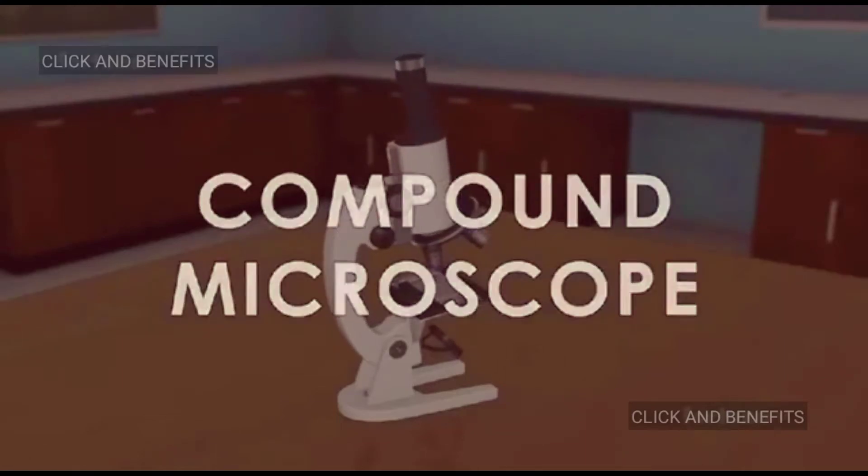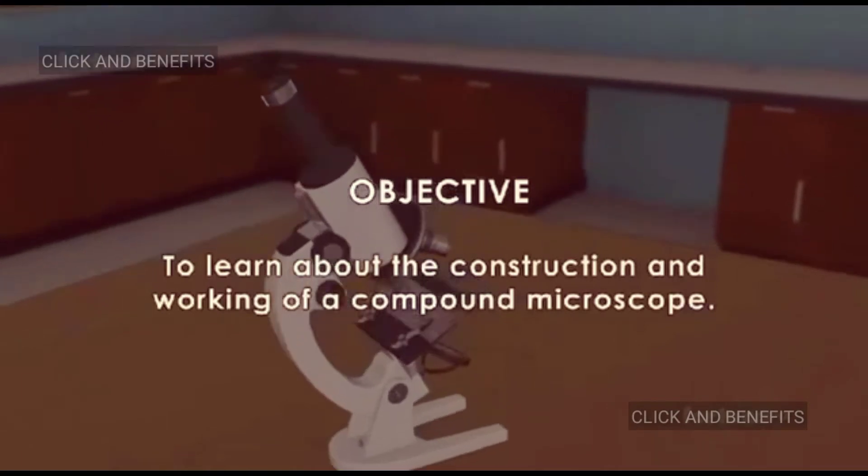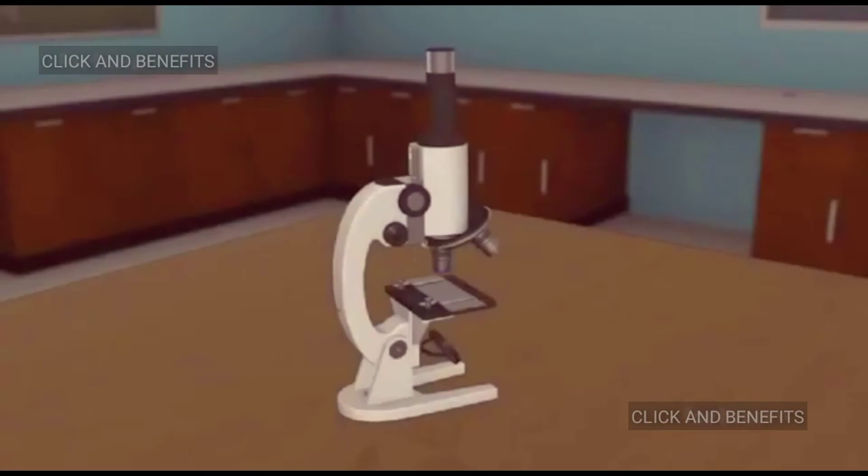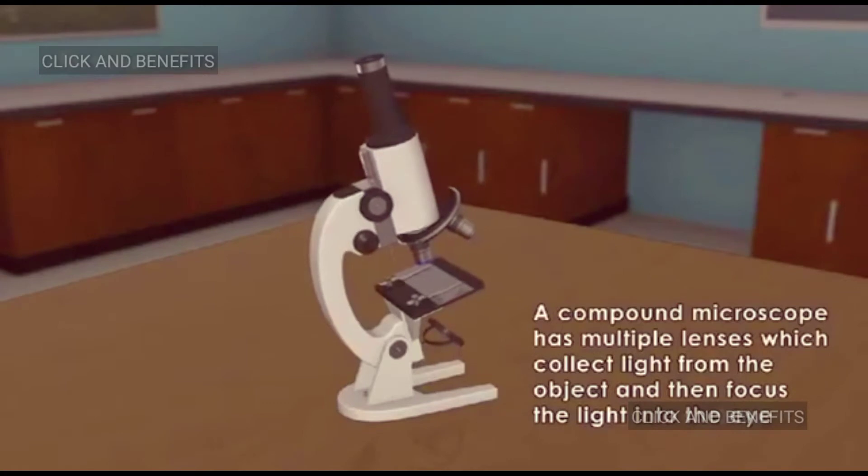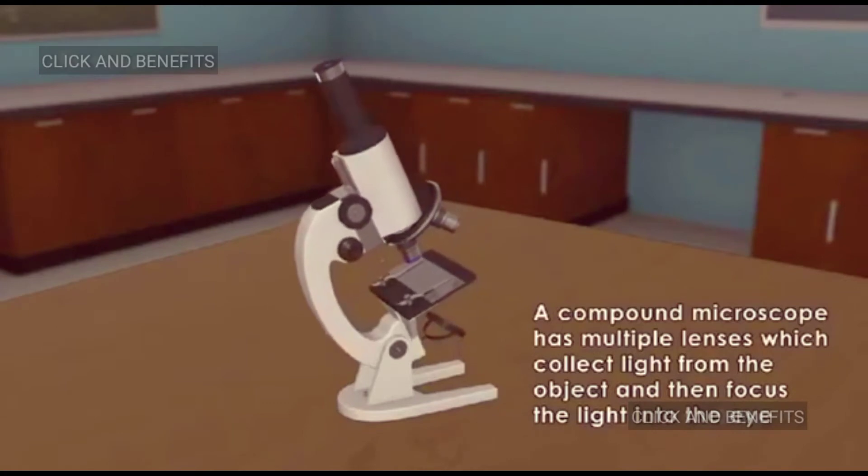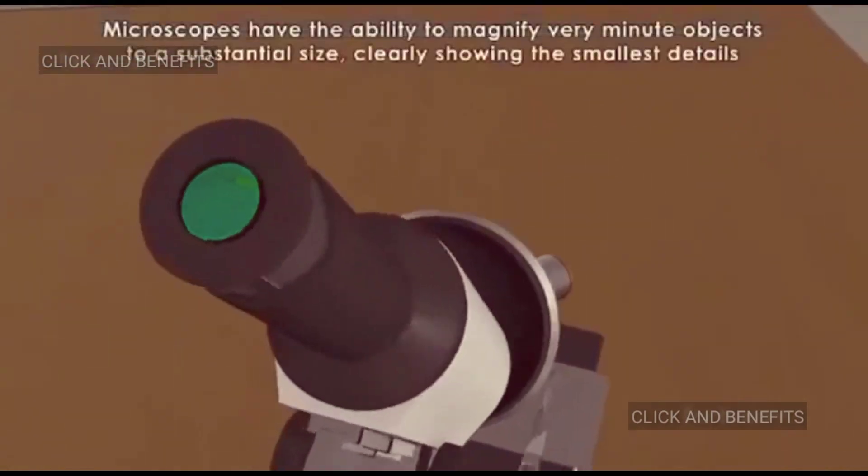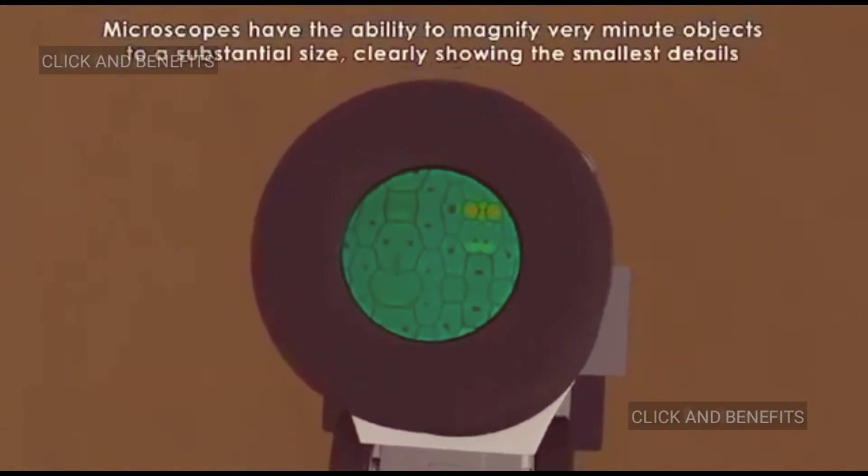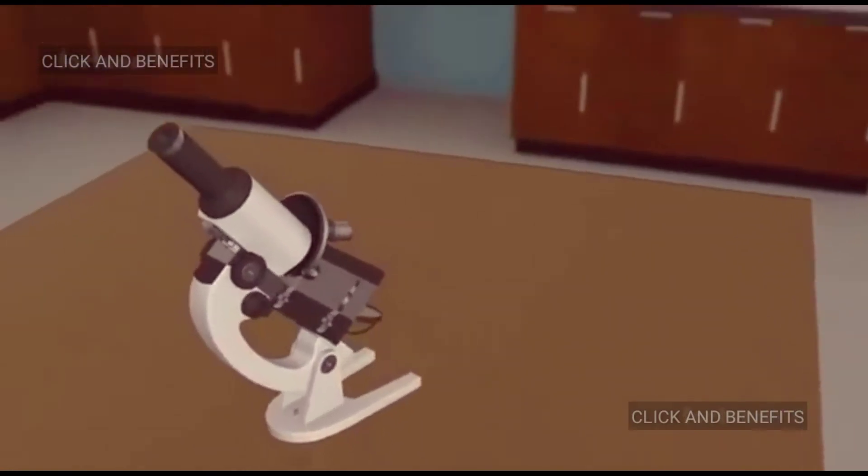Compound microscope objective: to learn about the construction and working of a compound microscope. A compound microscope has multiple lenses which collect light from the object and then focus the light into the eye. These microscopes have the ability to magnify very minute objects to a substantial size, clearly showing the smallest details.